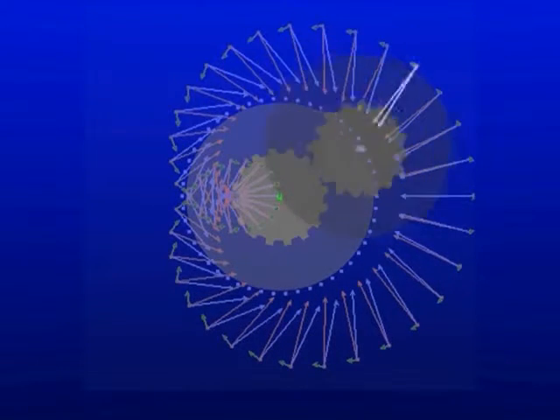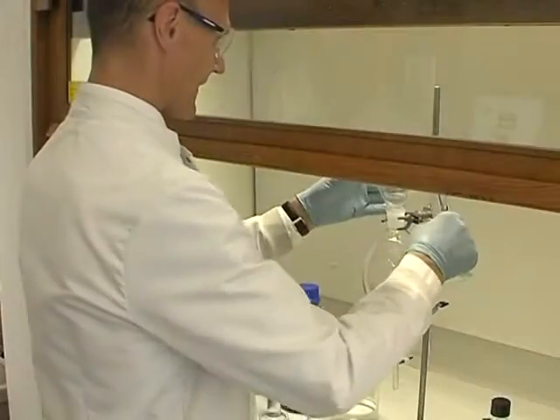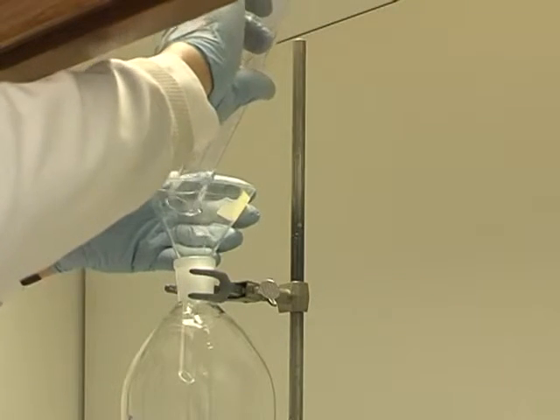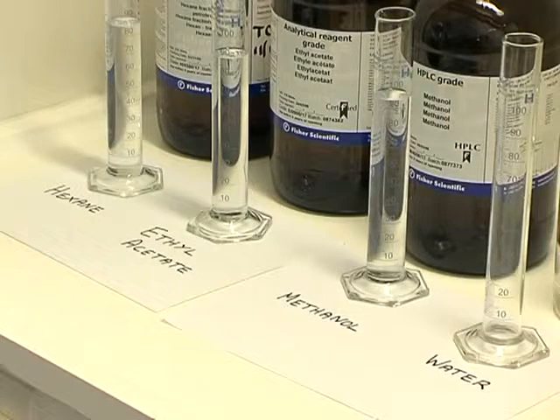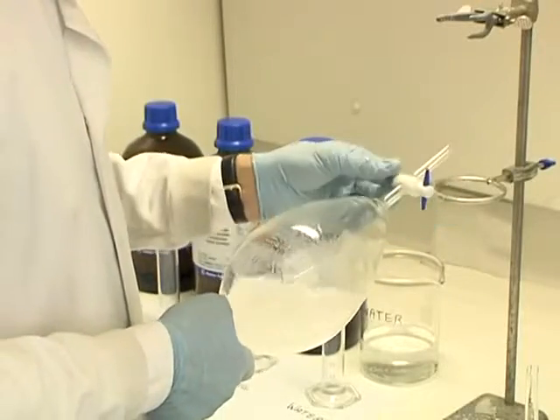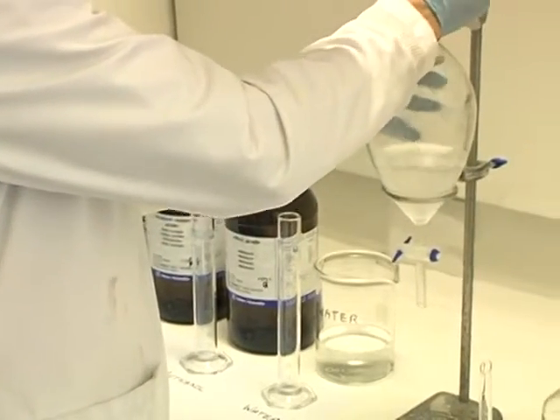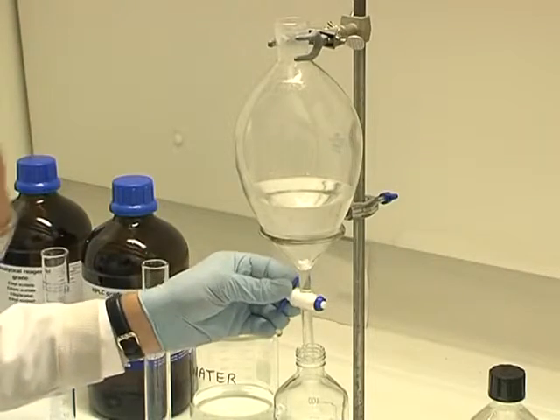A two-phase solvent system is placed inside the coil. A simple example of such a system would be heptane and water, but a more likely system for a purification might consist of heptane, ethyl acetate, methanol, and water. This gives a two-phase system, with an upper organic layer consisting mainly of heptane and ethyl acetate, and a lower aqueous layer consisting mainly of methanol and water.